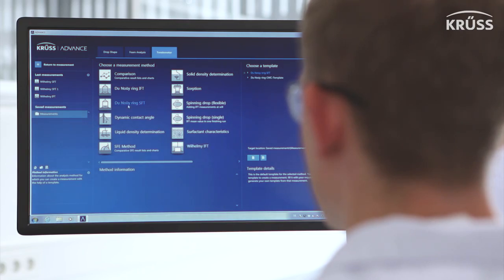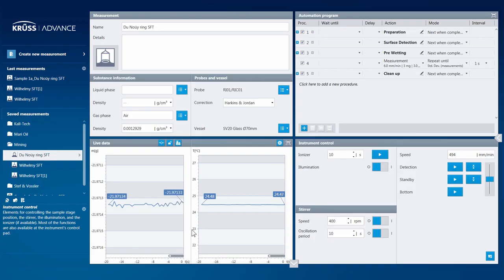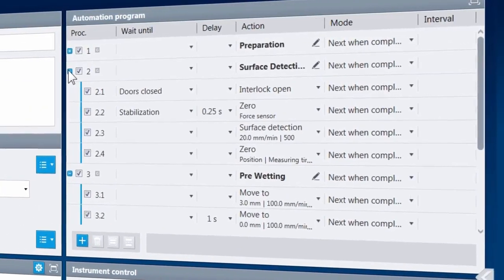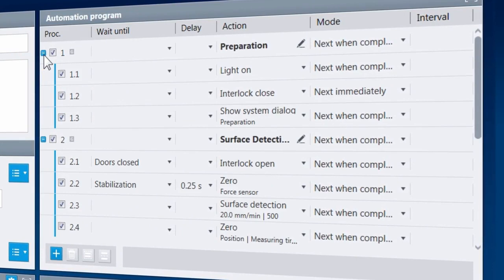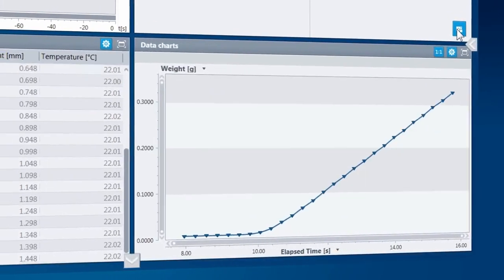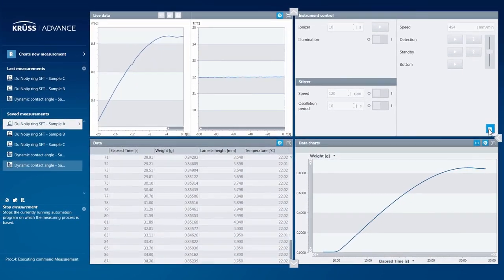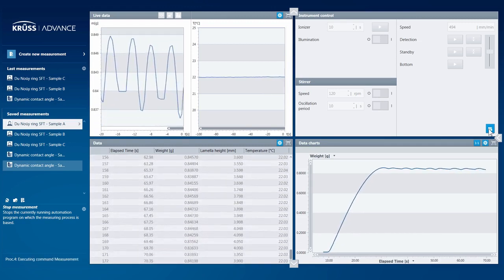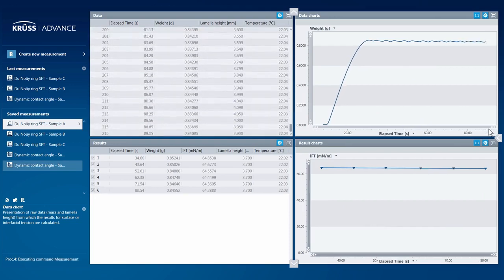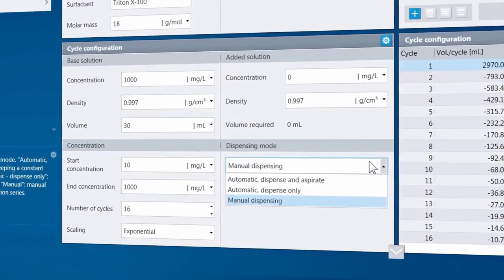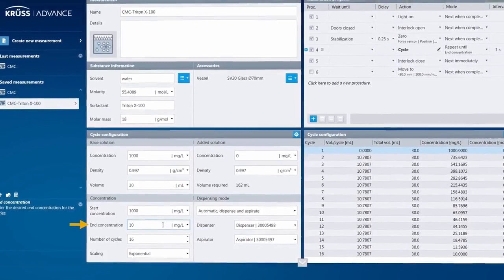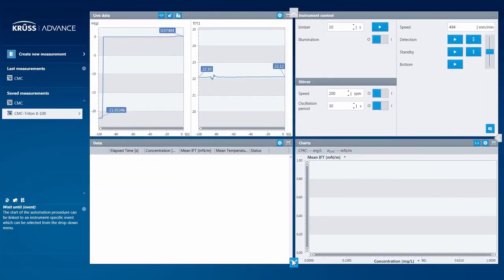All of the possibilities which the K100 offers are controlled through one intuitive piece of software: ADVANCE. Every measurement method has pre-made but easily adjustable automation program templates so that you can jump right into the science. Additionally, even when making surface or interfacial tension measurements, live measurement data values are actively displayed as clear and comprehensive graphs and charts. Using this software, it is possible to make CMC measurements manually or fully automatically, and both forward and reverse, which helps you to reduce cleanup times after the measurement.